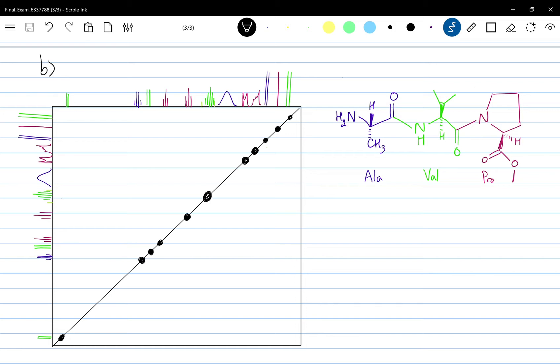First of all, I should say what NOESY is in general. NOESY is an NMR technique — a two-dimensional NMR technique — which is used to determine the through-space interaction between nearby protons. For this specific arrangement of alanine, valine, and proline, it will give unique NOESY spectra compared to other possible arrangements of these three amino acids.